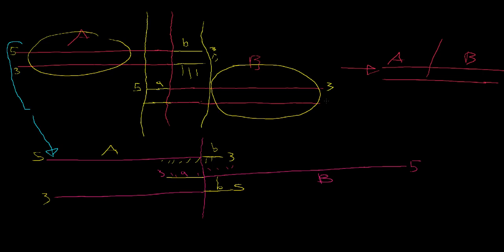And we've taken our big B bottom strand, which here I'll draw in the 5' and the 3', and that has come down right below it. And these two strands have annealed at this overlap region. So this overlap, we've gotten this kind of a hybrid thing where they didn't re-anneal to their fully complementary domain, but they've annealed only at this one region, this overlap region, in order to create this kind of partially single-stranded product.